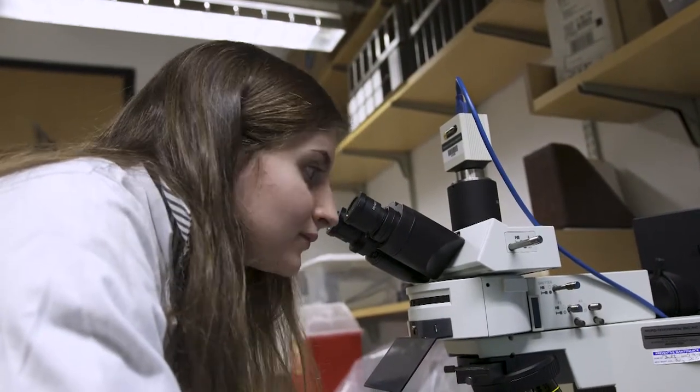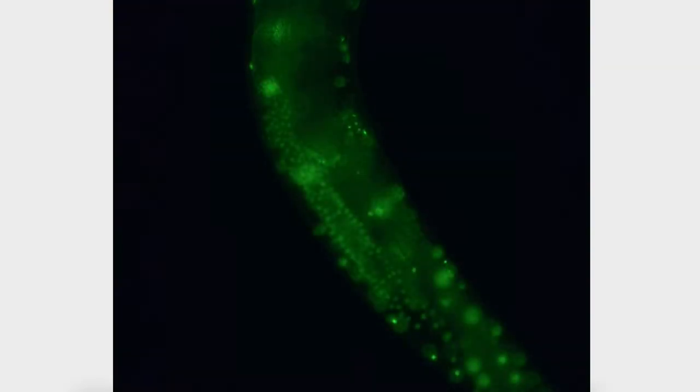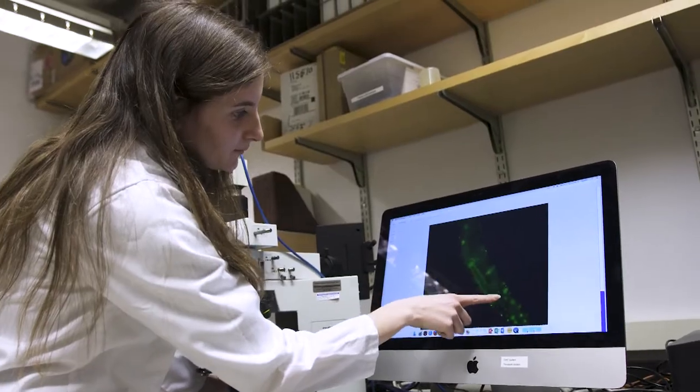The oocyte is the cell that is going to be fertilized. It then develops into an embryo. To observe the oocyte maturity, we introduced this marker that glows because we incorporated GFP, which stands for green fluorescent protein.